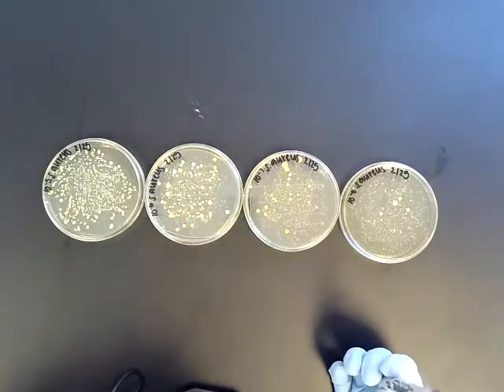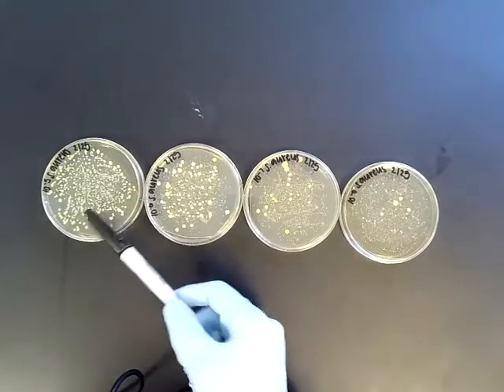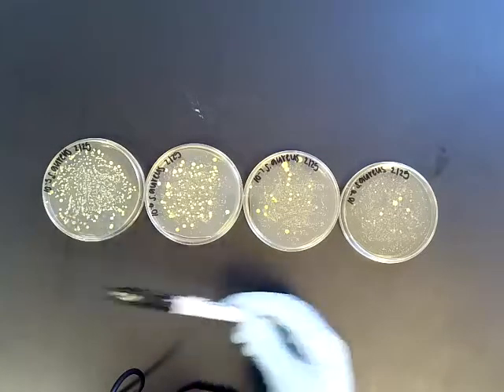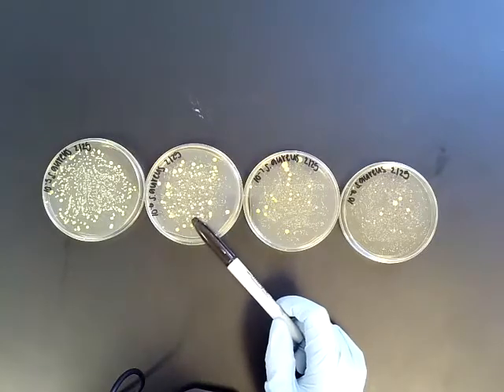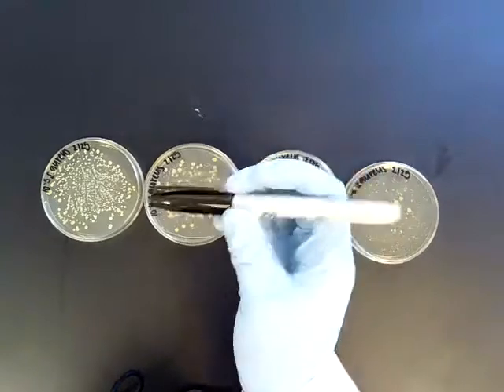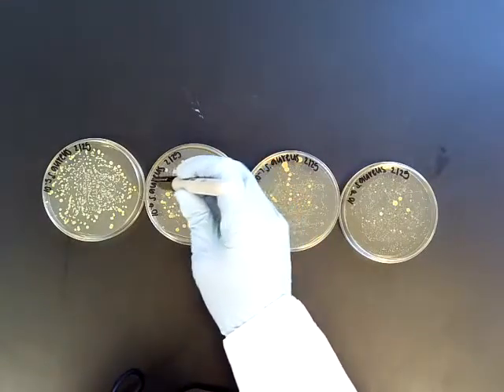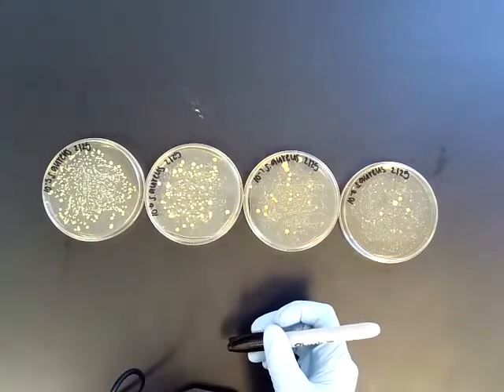And we want to identify a plate that has between 30 to 300 colonies. If it's less than 30, the math can't be accurate, and if it's more than 300, typically the colonies are too close together to be able to differentiate them. So again, it'll be inaccurate. This one here looks like it has far too many colonies, so we would not choose this plate to count. And then an easy way to count these would be by using a marker and just tapping on each one of the colonies as you count it and keeping track from there.